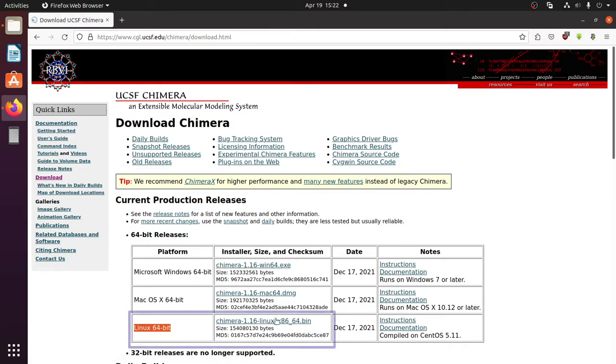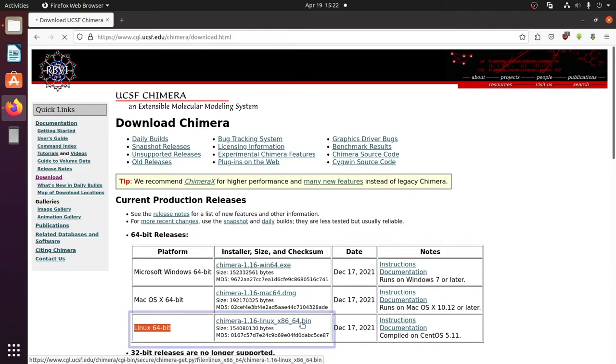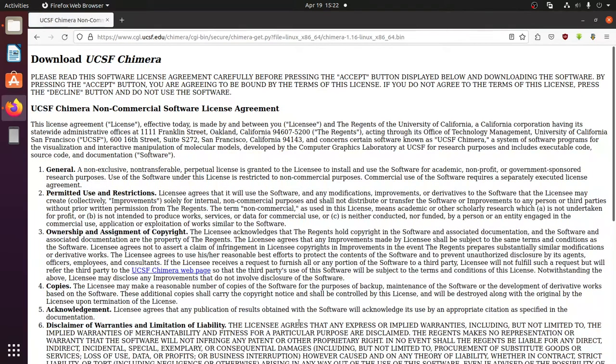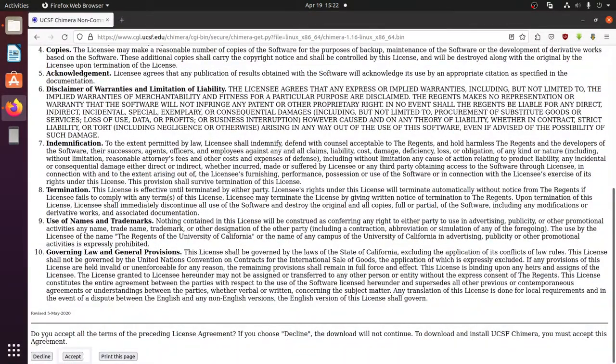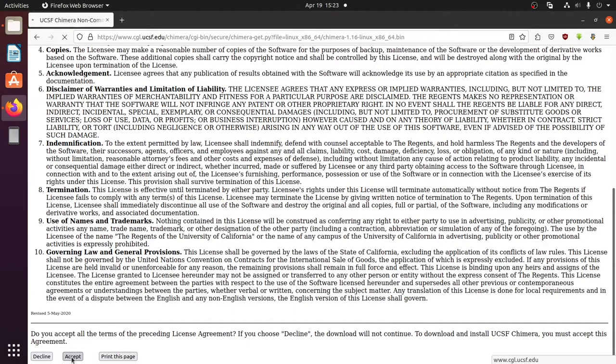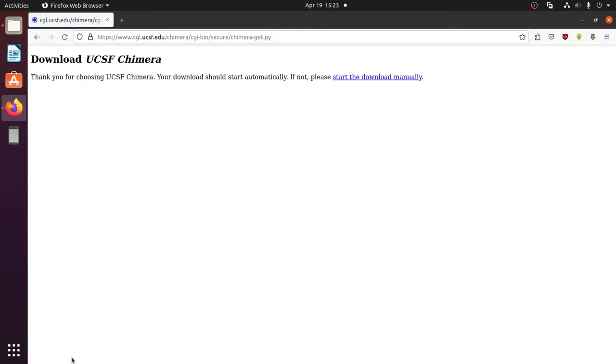Click 32-bit if you have the older 32-bit Ubuntu. You should read the license agreement, then scroll down and click accept. It starts to download Chimera now.